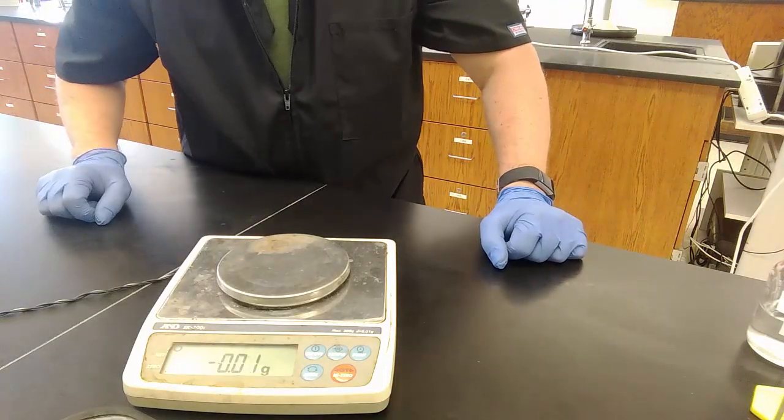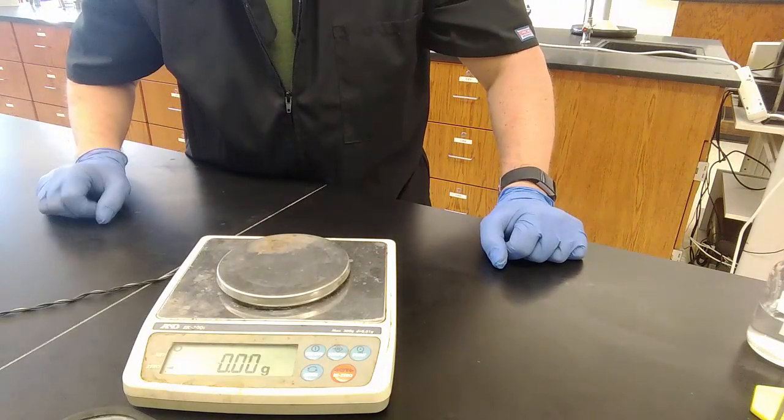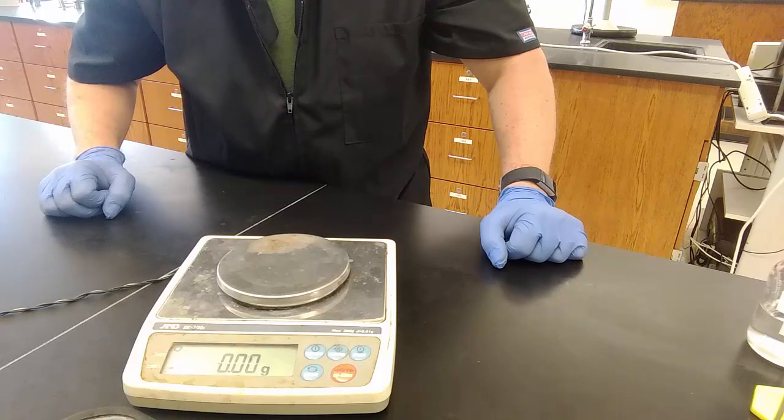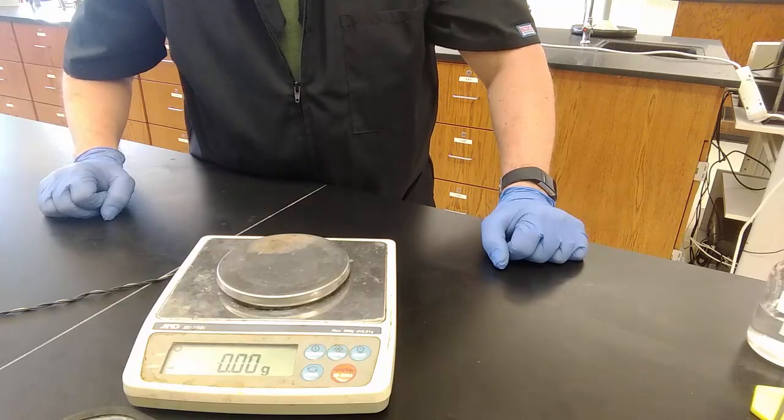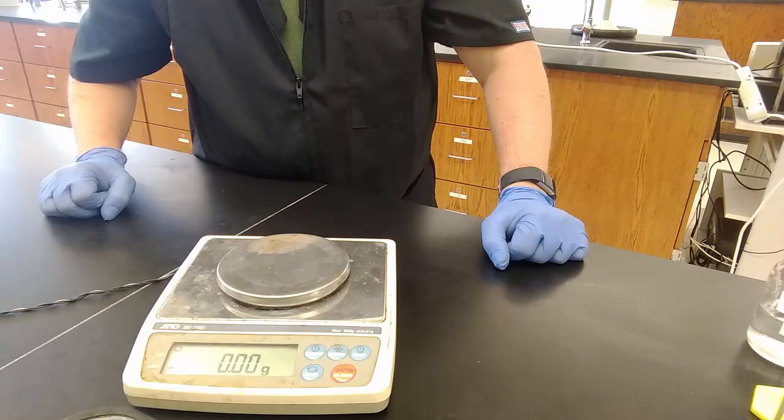That's it for the density of an unknown liquid. You calculate the density of the liquid, record it on line 2F, and look at table 1.1, and see what you think it is, and put that identity on line 2G.